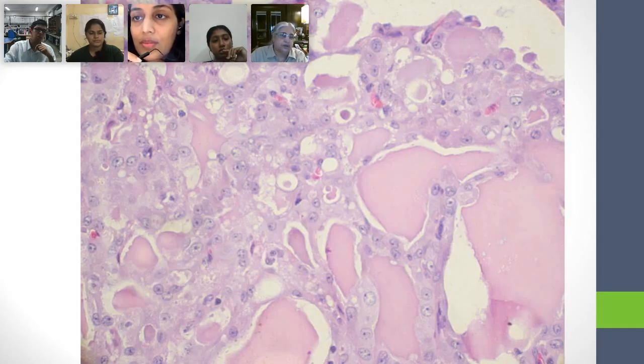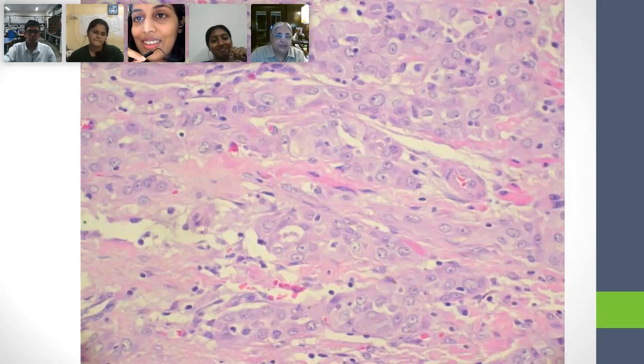Okay, and you can see a number of small lumina. Yes, ma'am. You saw large lumina in the thing that you wanted to call follicles. Are all these lumina of the same circular shape? No, ma'am. Some are circular, some are irregular in shape. So I don't think you will want to call these follicles, would you? No, ma'am, you wouldn't want to call them follicles. All right. Very good.